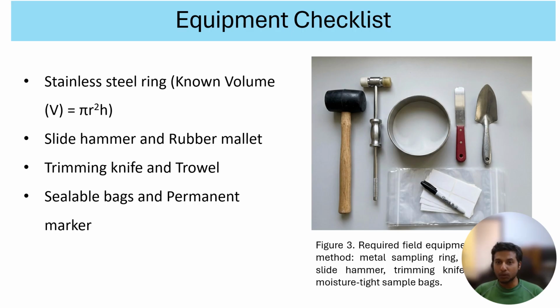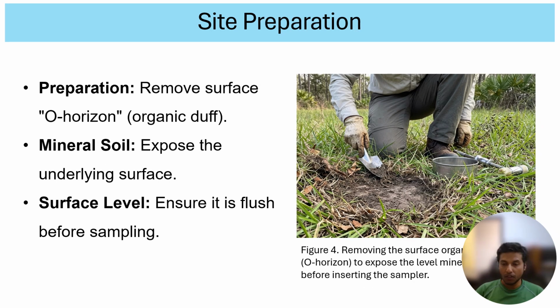Once we are ready with the equipment, we can go to the field and start our bulk density measurement work. As you can see in the picture, now we are ready to begin the actual field sampling. Step one is site preparation.